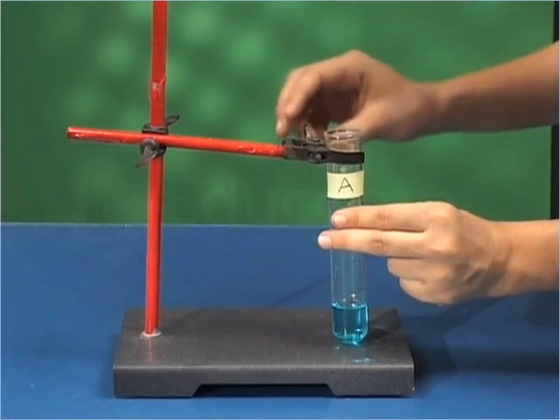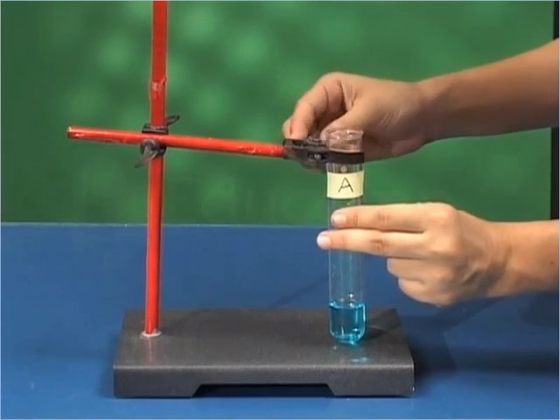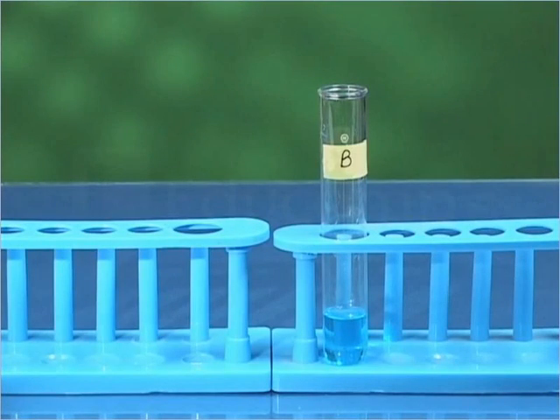Fix test tube A on the clamp stand and keep test tube B as control sample in test tube stand.